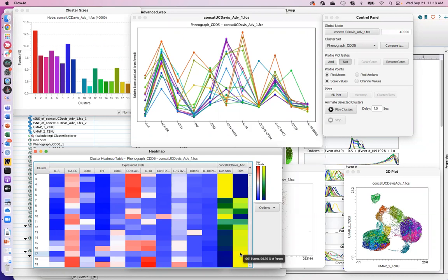And of course, here we can see that, okay, cluster number 17, you've got a pretty heavy split again, right? Basically 100 to 0. Another one, 97, 98 versus 2. And 99, again, 100 versus 0. Okay, and then as we move to the colors that are starting to cool off, you can see that percentage now becomes like 90-10. Here's 80-20, let's say. This one's pretty even, 50-50. Again, another non-stim cluster, so on and so forth.